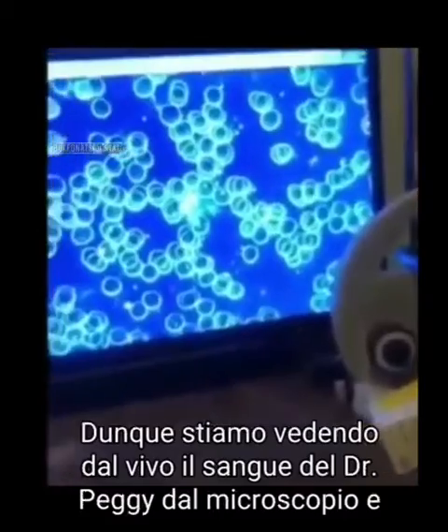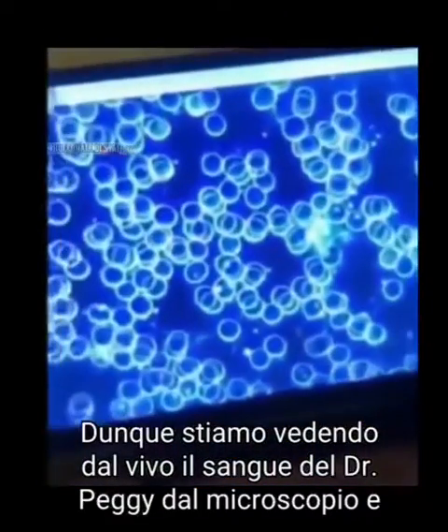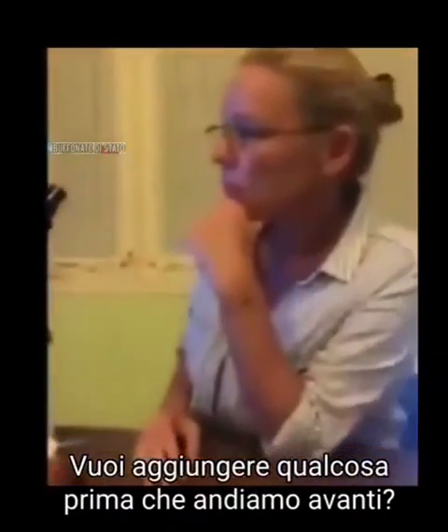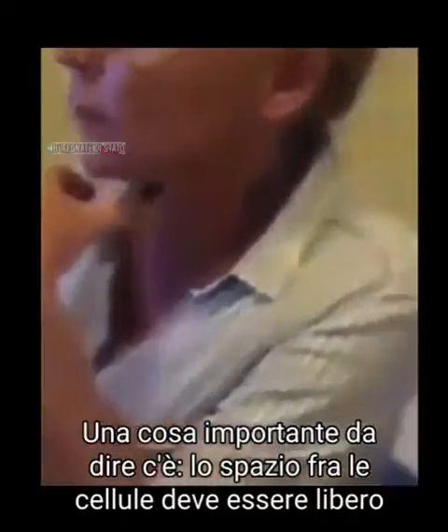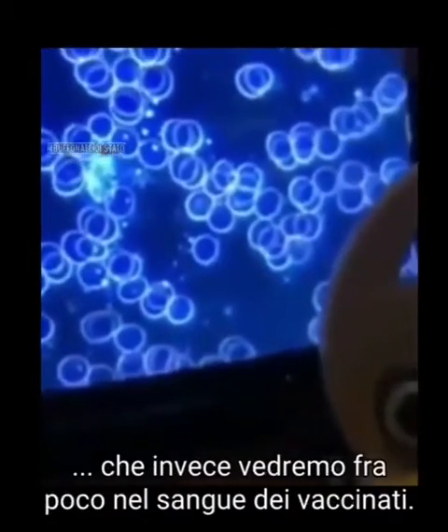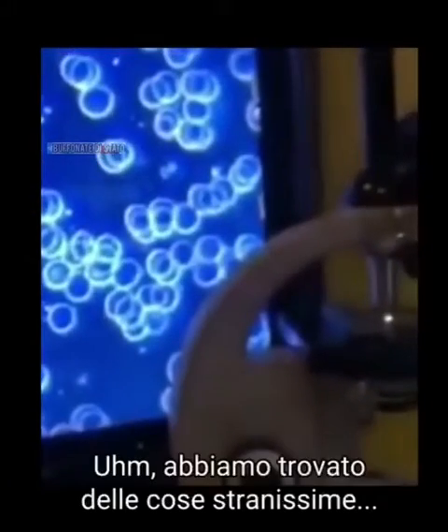All right, so what we can see, we're looking at a live feed of Dr. Peggy's blood, and we can see good quality blood cells. Do you want to add anything before we look at? No, that's pretty much it. No. What is also important actually that the serum space is clean like here, so there shouldn't be any things what you will see soon on the vaccinated people.